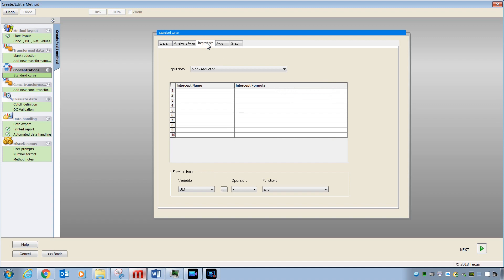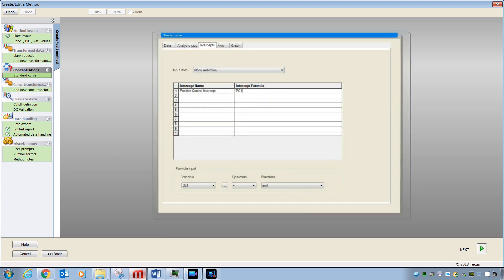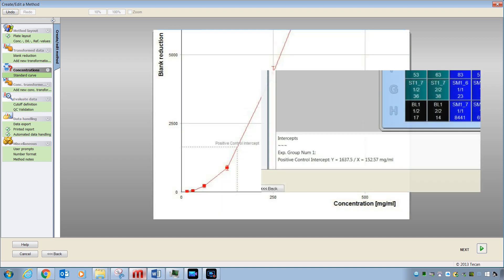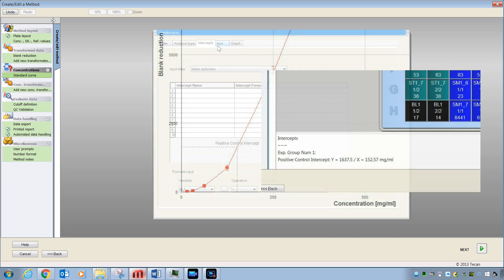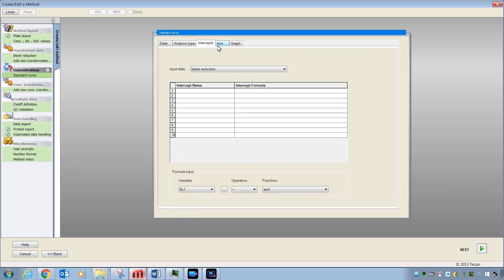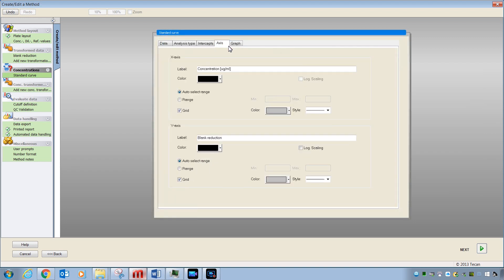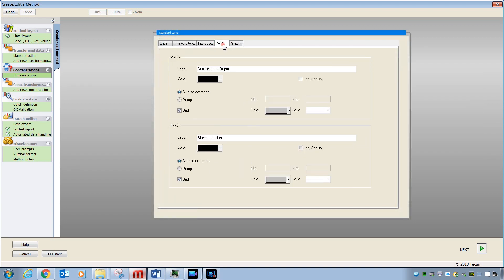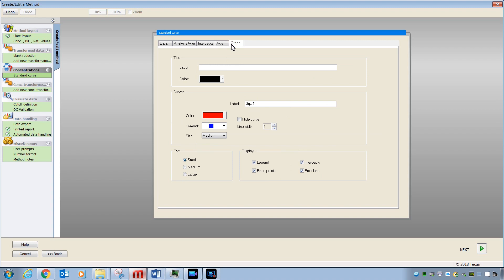The Intercepts tab is where you can enter certain values and test to see where those values intersect the curve like this. The Axis and Graph tabs are simply places where you can enter things like the label for your axes and also determine the color scheme and size of certain markers in the curve. Once you are done entering settings for your standard curve, you can move along and look at some of the other choices here in the left-hand column.